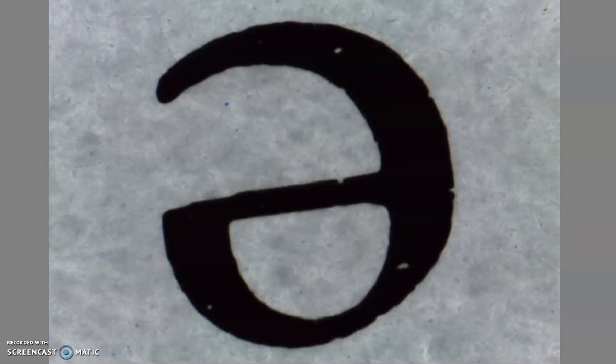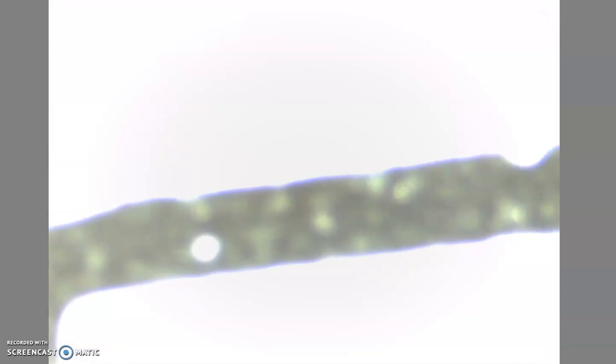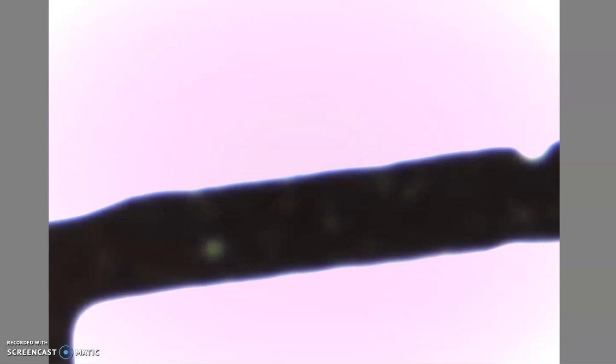And what we can actually do here is go up to the highest magnification that we have in our lab, which is the 40x objective. So I'm going to go ahead and slide that, sliding into our 40x. Now what you've noticed here is you can still kind of see the E, right? But you can't see all of it anymore. We lose the entire picture as we zoom in, because we're looking at a piece of it. You can also still see that it's really, really blurry. So what we need to do is, again, use the fine focus to get this right into picture perfect view. And here we are. Once you get here, we can see the line. So this is the middle line of the E.